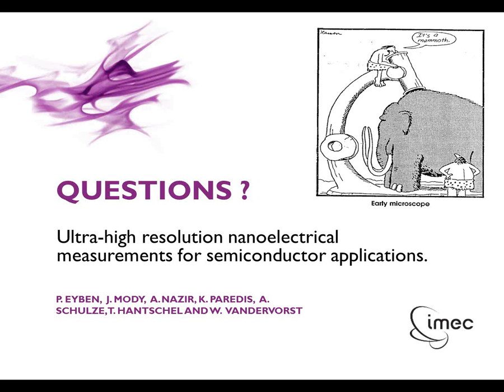You can use the AFM in its full functionality. So whatever modes your AFM is equipped with, you could execute those in a controlled environment. Probably the question then is, which modes will benefit from it? It's more a question towards the samples, I think. If the samples are semiconductor, chances are it can benefit from it. Yeah, it's strongly dependent on the sample.